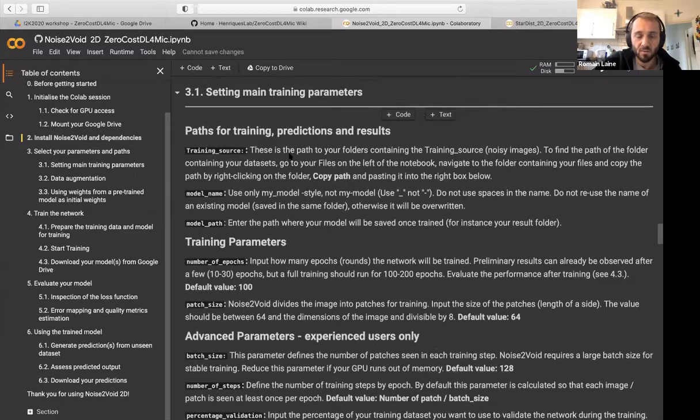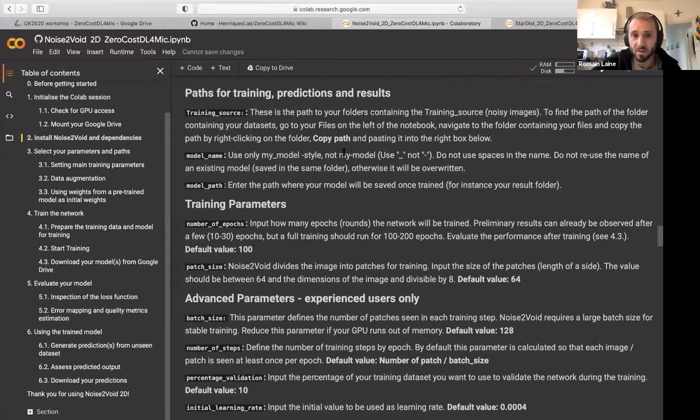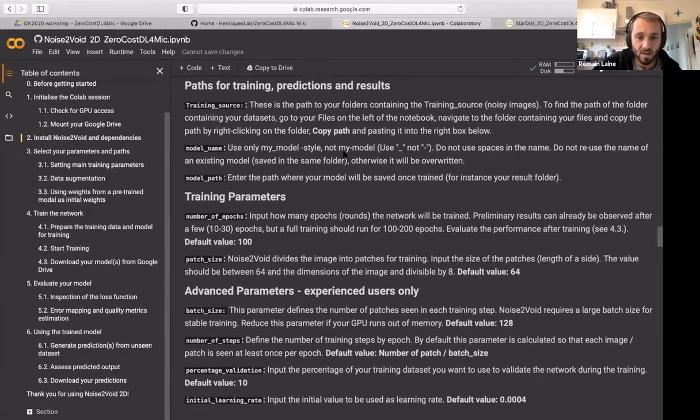The first thing that we have here is a set of text and parameter descriptions that will guide you through what each of those parameters means and how to set them up. There is some variability between networks because, although some parameters are the same across the different networks, some networks have specific parameters that need to be set, in which case they are accurately described in that part.